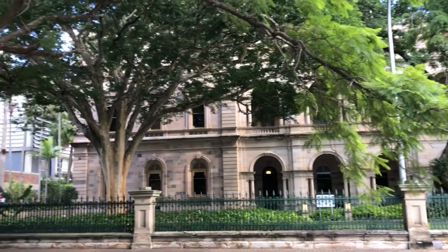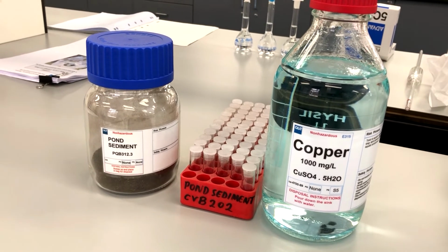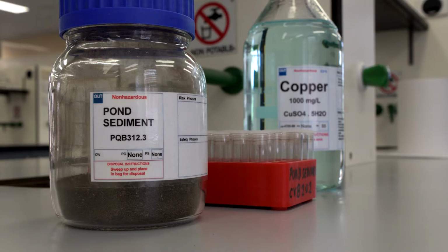To determine the copper level in the pond sediment, a sample of this sediment was taken by a grab sampler and filtered and dried according to the procedure in the practical manual. A sample of this sediment was weighed into a beaker using the weight by difference methodology.